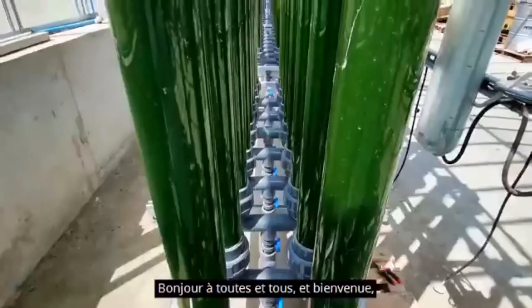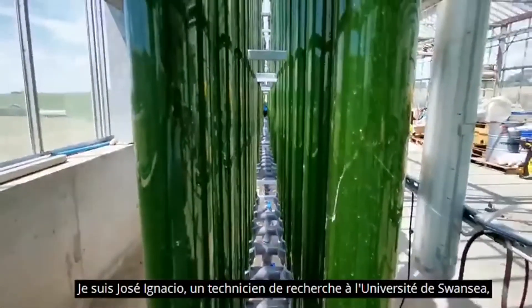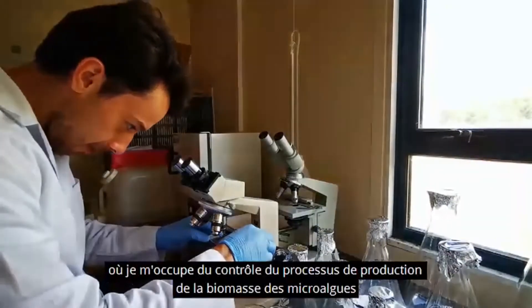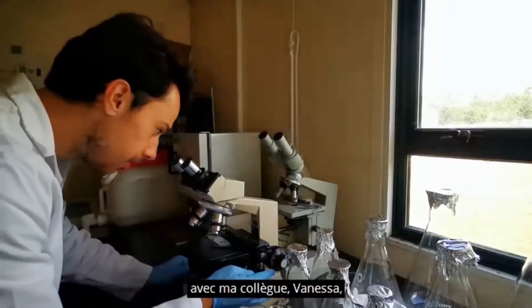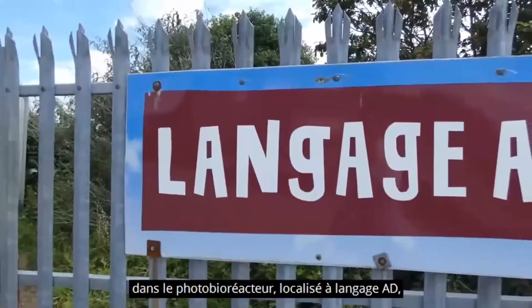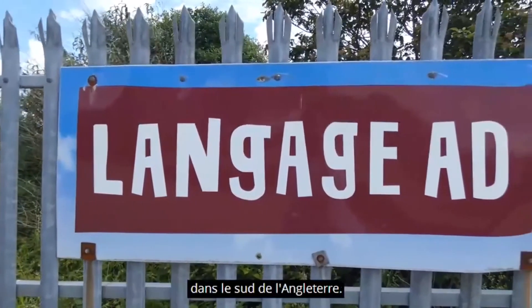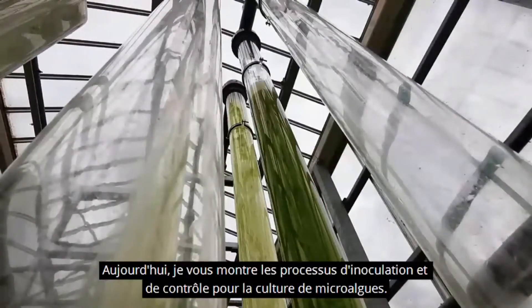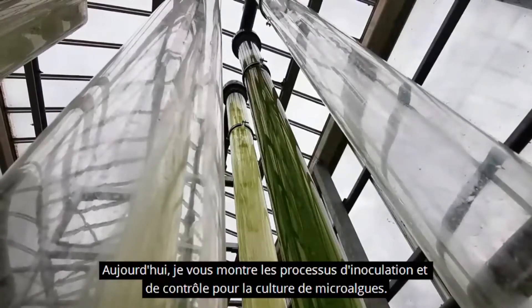Hello everyone and welcome. My name is José Ignacio. I'm a research technician from Swansea University, in charge of controlling the microalgal biomass production process, together with my colleague Vanessa, in the photobioreactor located here in Langage AD in the south of England. Today I will show you the process of inoculation and control that we make for the microalgae culture.